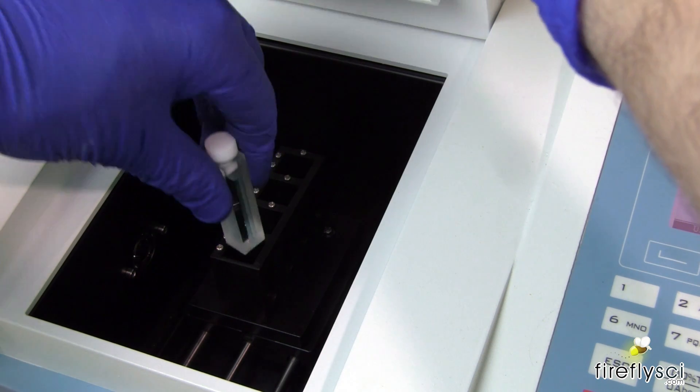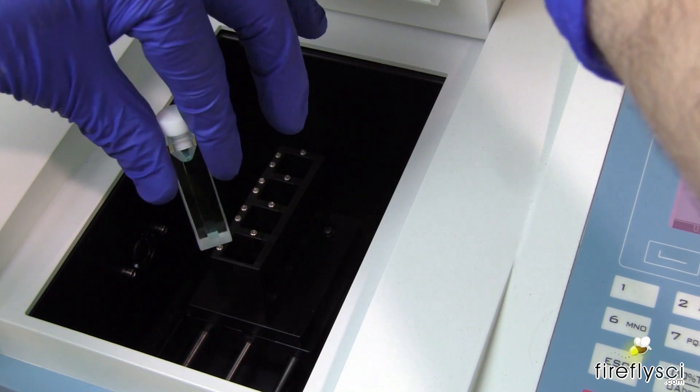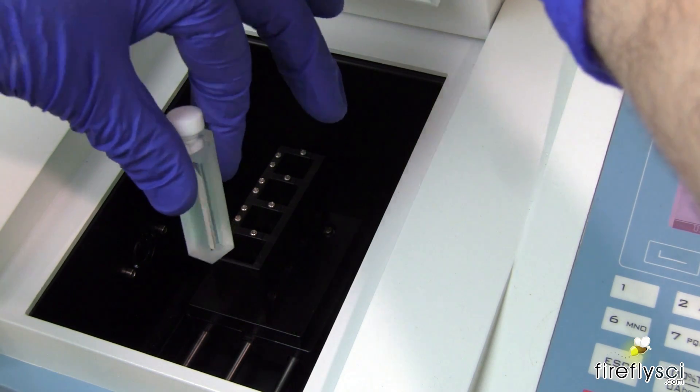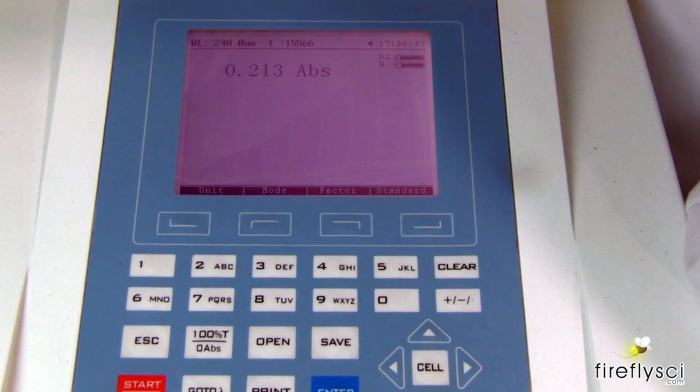When handling cuvettes, always make sure to pick them up by the sides. Just close the lid and take the measurement.